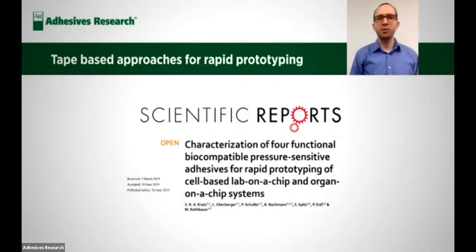A recent report from Rothbauer et al. in Scientific Reports discussed the characterization of 4 biocompatible pressure-sensitive adhesives for this tape-based approach for lab-on-a-chip and organ-on-a-chip systems. And if you look at the approach that they're taking, it uses much lower cost equipment relative to the microfabrication path that I discussed on the previous slide.